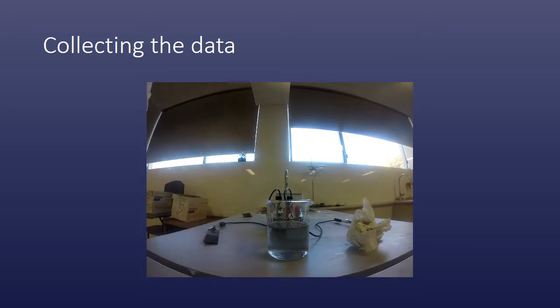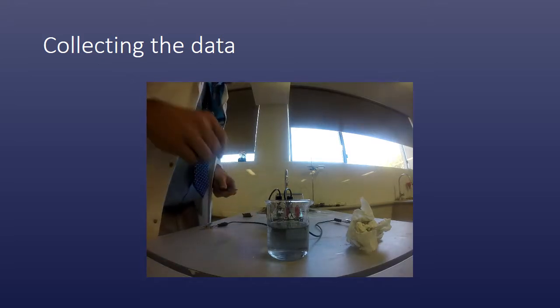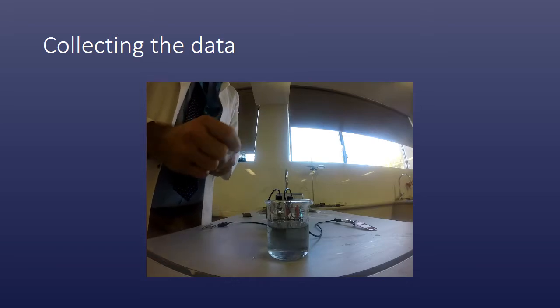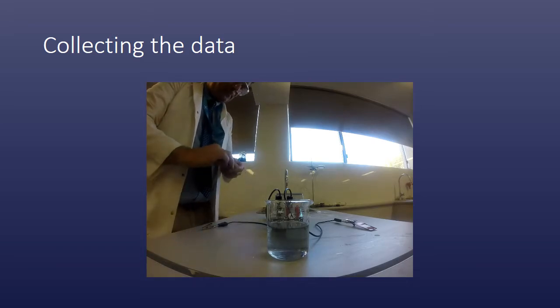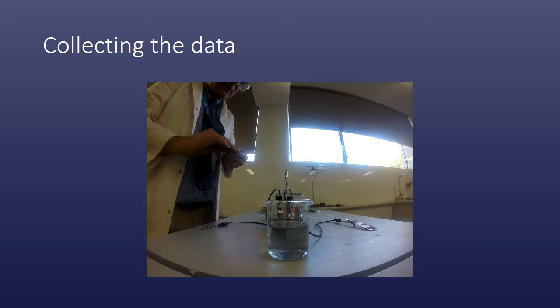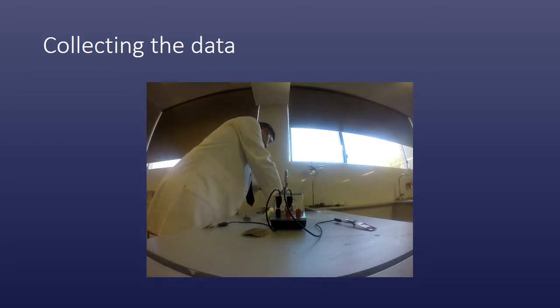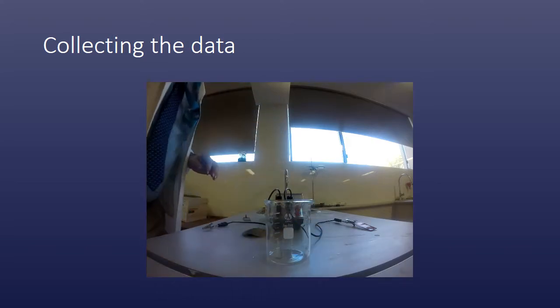So if I keep the sulfuric acid, which seems to be the best one, and replace my zinc electrode, which is doing all the bubbling, with another copper electrode, what happens then? So what do you think would happen if I had 2 copper electrodes, both sitting in this sulfuric acid, which is a little decolorized now? I might just replace that. So it's a little bit easier to see.